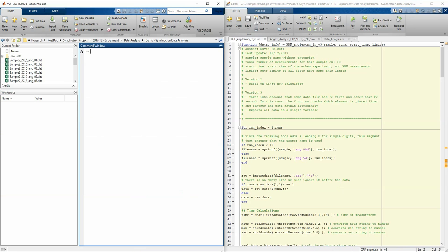So if I go back to my function, okay, and then the limits. In order to be able to plot everything and to compare it properly, we want to make sure that the limits of all the plots are the same so we can see how the line is changing over time. At the beginning, you can leave this to the value that's already in the file, but then as you go on, you'll realize how to change those.